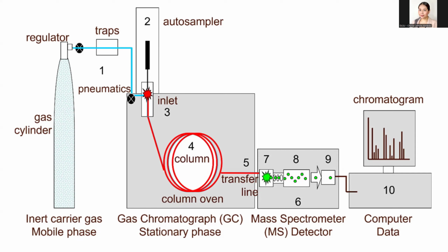from other compounds. Now, in the second phase, the mass spectrometry phase, as each separated compound exits the GC column, it can now enter the mass spectrometer, where it is bombarded by high-energy electrons in the ionization chamber. So this bombardment breaks the compound into charged fragments.